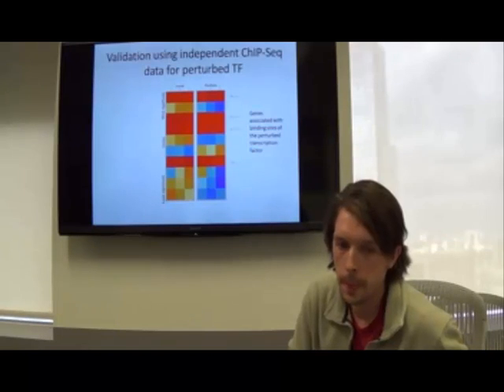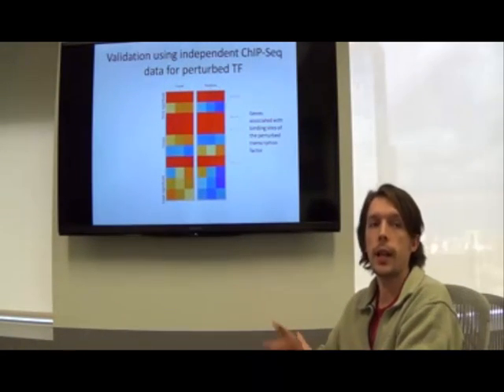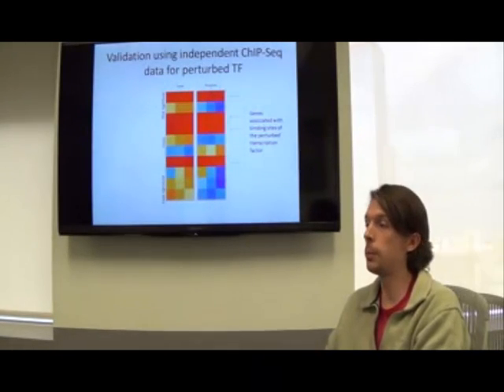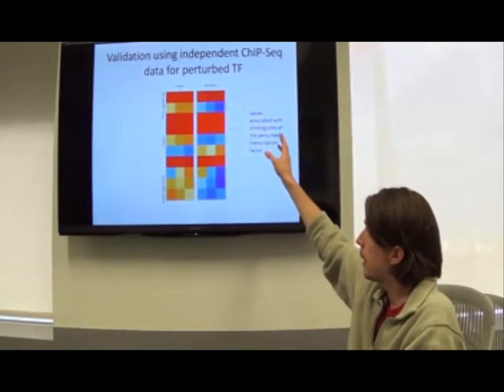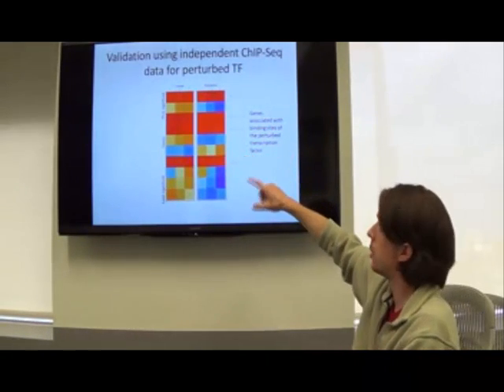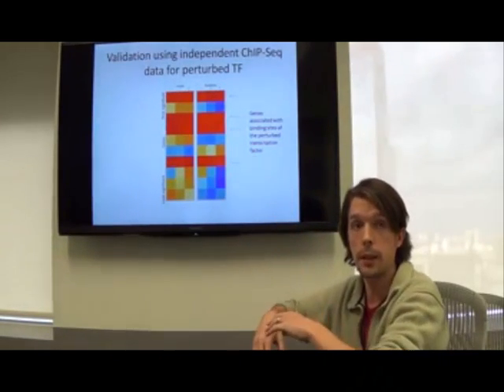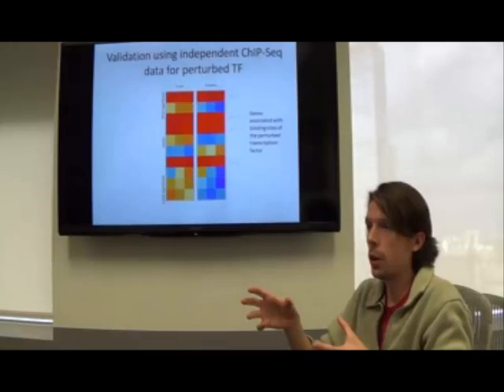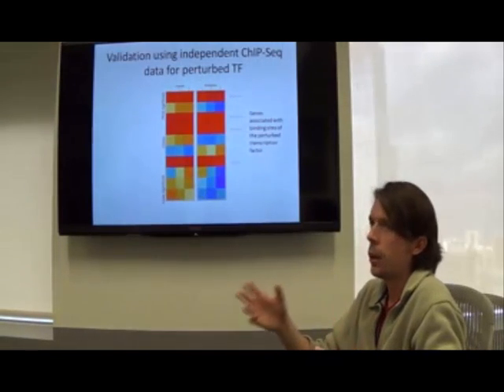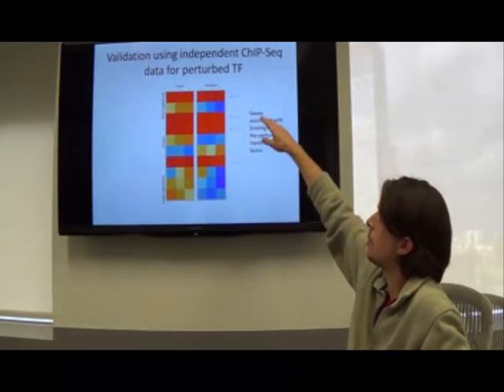Now, if our differential expression analysis is to simply randomly pick genes, we just put them in a hat, then what will this look like? The red lines will be uniformly spread throughout this list. They'll be completely random. But if we do a really careful job with the differential expression analysis, what we might hope is that these red genes, the ones with the arrows, will tend to be at the top.